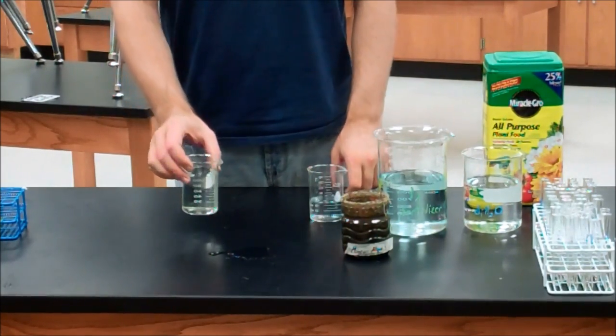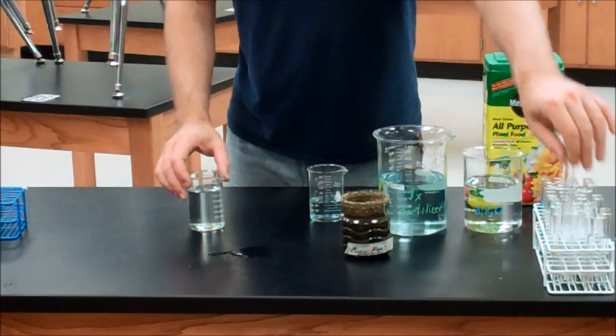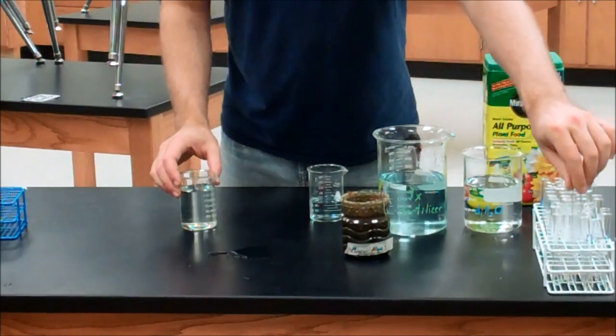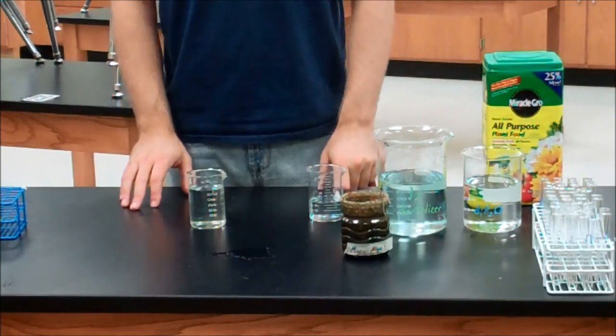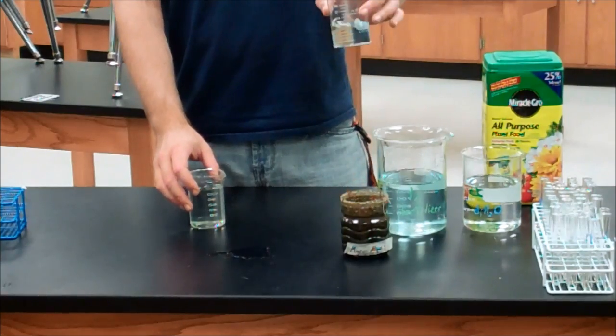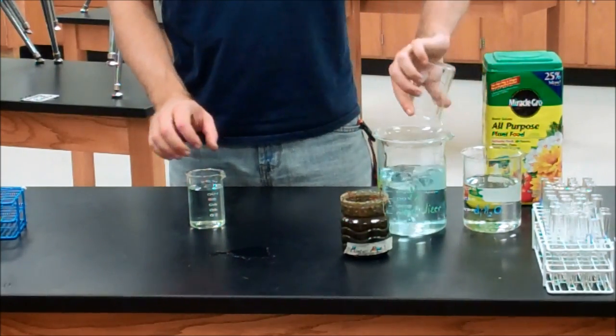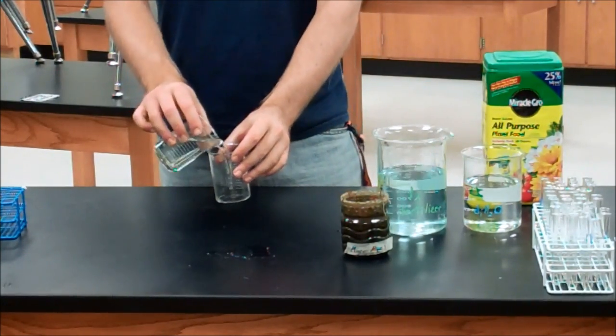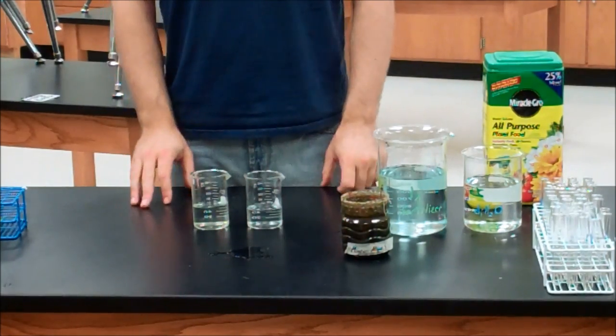From here you can either take another sample into another test tube and inoculate and have a 0.5X fertilizer trial. Or you can continue to dump this out and do yet another dilution and keep going.